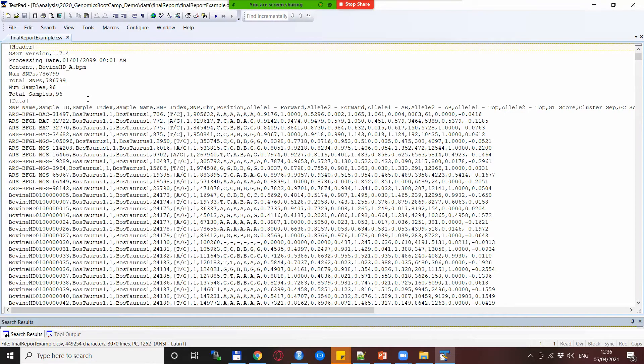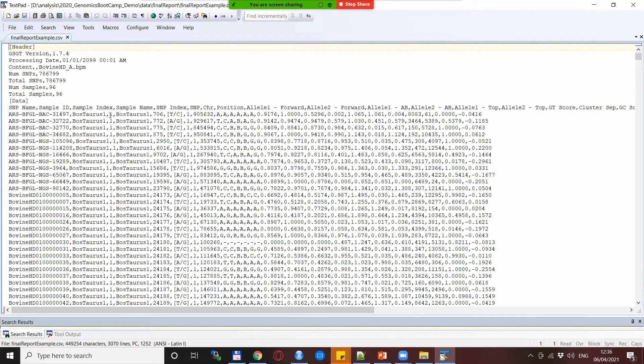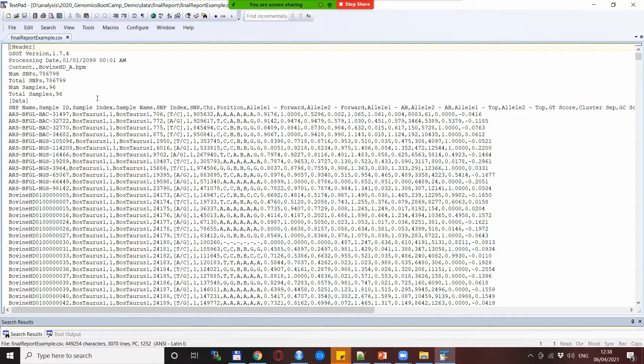Just a short note on the header: this basically contains information about the genotyping itself. This file has been anonymized by me so basically the two things I changed was the date of genotyping and the IDs of the animals.